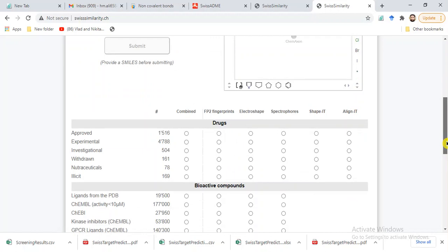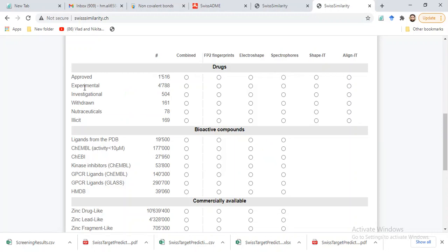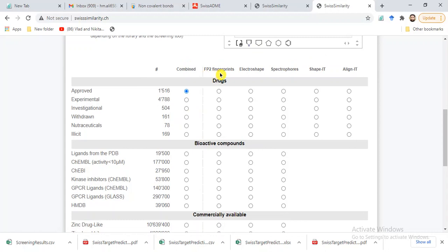We have several options: we can select FDA approved drugs to find similar compounds or analogs of our compound, or experimental drugs, or investigational drugs. We can also screen on the basis of FP2 fingerprints, or use a combination of all of these fingerprint types.